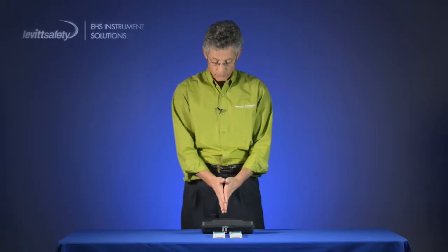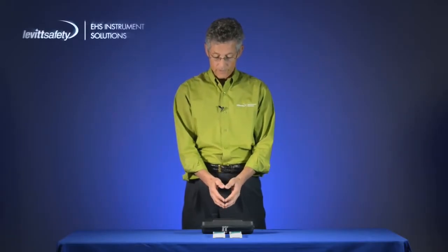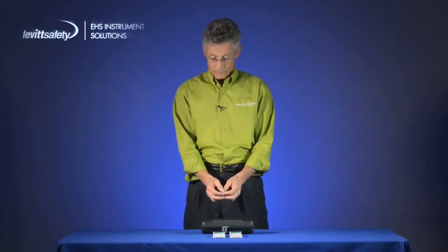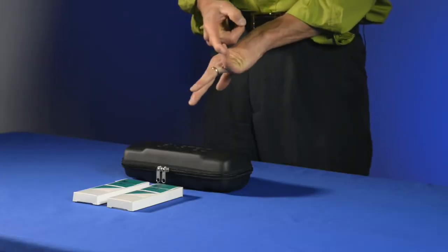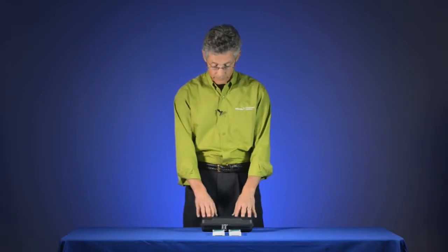The GAS-TEC detector tube system has over 500 different tubes available. These tubes measure the concentration in air right here and right now. The tubes are used because they are intrinsically safe by design, pre-calibrated, inexpensive to use, available for a multitude of gases that are hard to measure otherwise, and they are a very simple device.